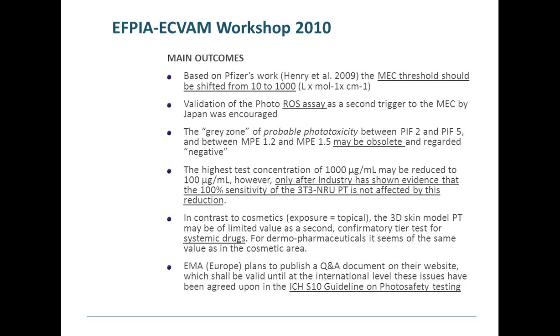So in contrast to cosmetics, where the exposure is always topical, the 3D skin model may be of limited value as a second confirmatory tier test for systemic drugs. It may be, and if you read the ICH guidance as it is now, for dermotopical or dermopharmaceuticals it seems of the same value as in the cosmetics area, because the kinetics are nicely modeled in the barrier model.